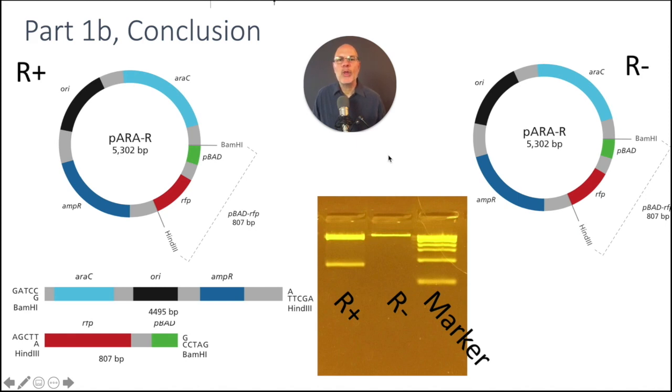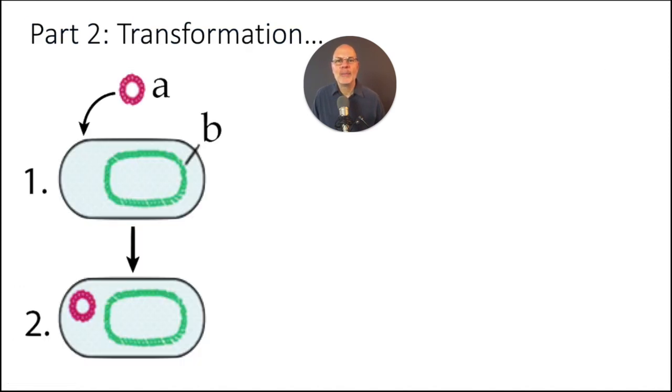We made it through the first part of this lab. Okay, so now we're going to move on to the second part of the lab, which is transformation. And what is transformation? We talked about this right up at the top of this video.